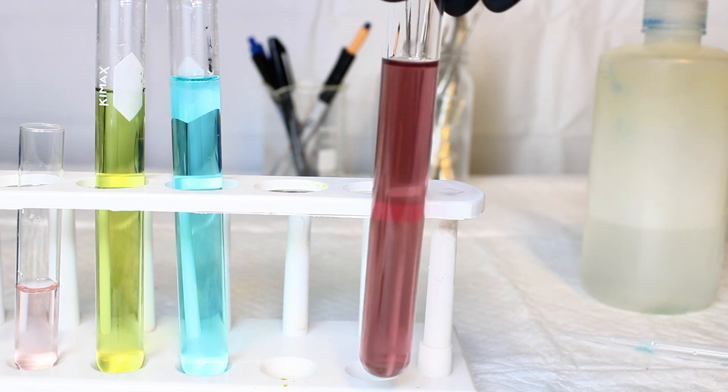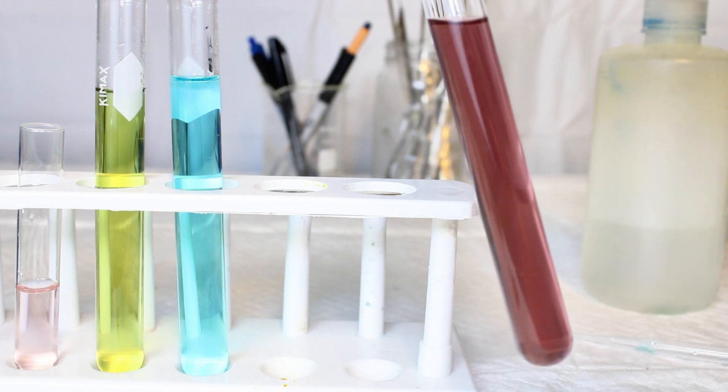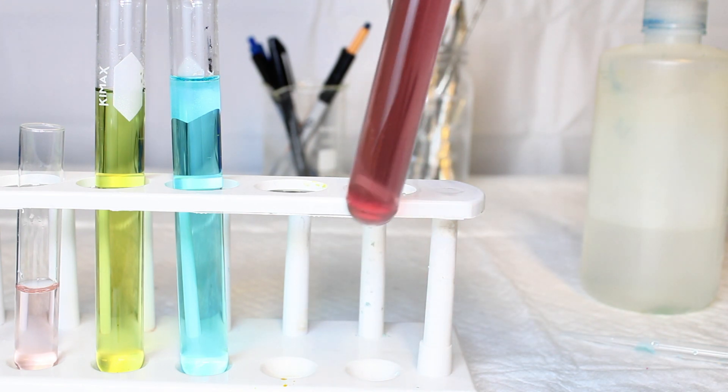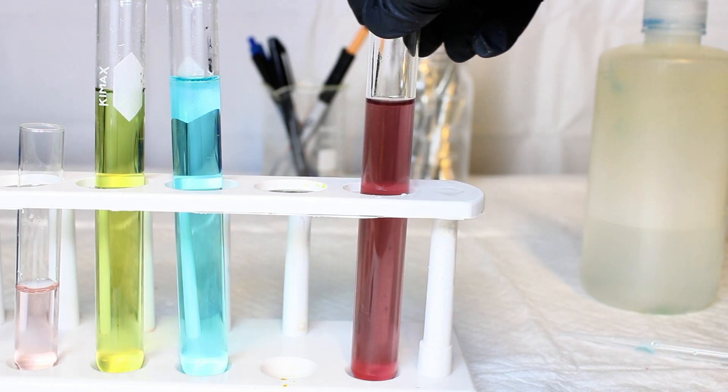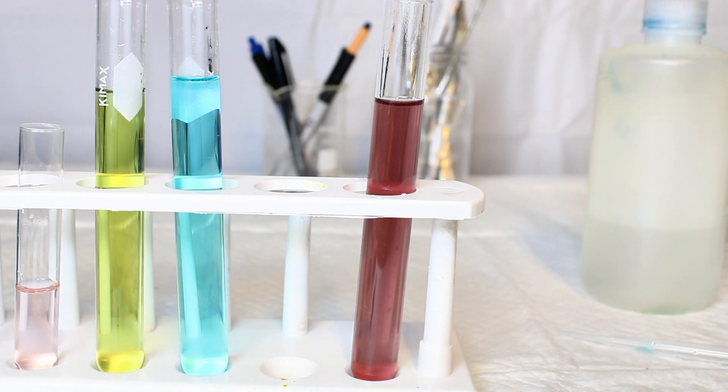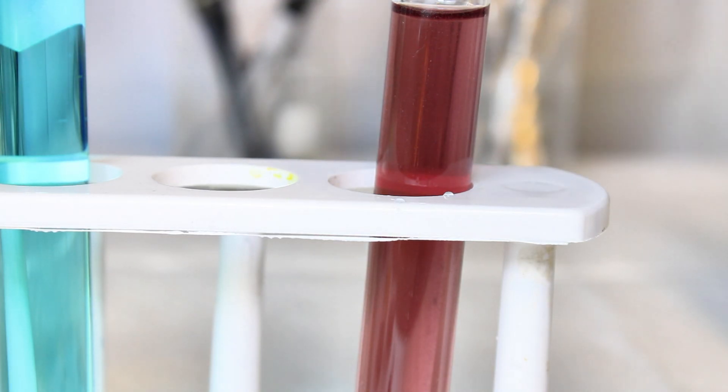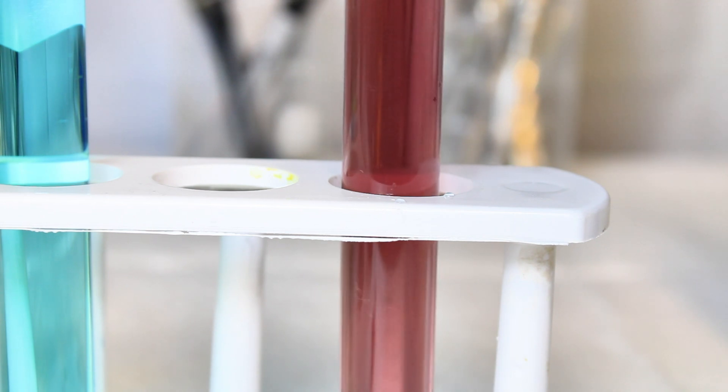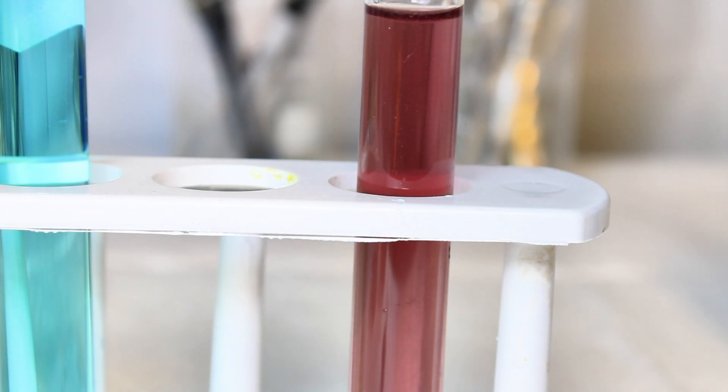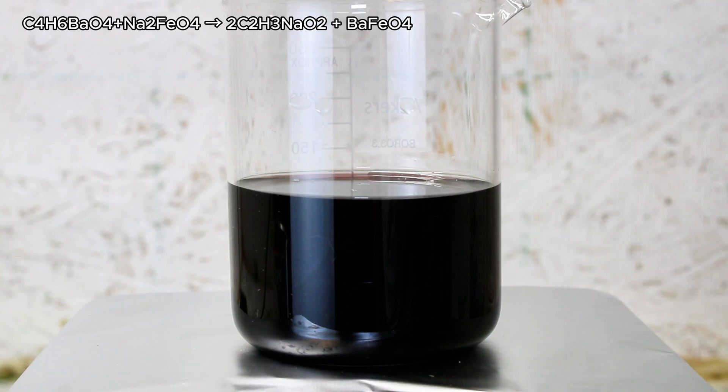I spent some time experimenting on this sodium ferrate because it's not really a compound I've ever heard of or encountered until I started this project. I really wanted to try precipitating this as a stable salt, and eventually I figured out that if I added a solution of barium acetate, it would be precipitated as barium ferrate.